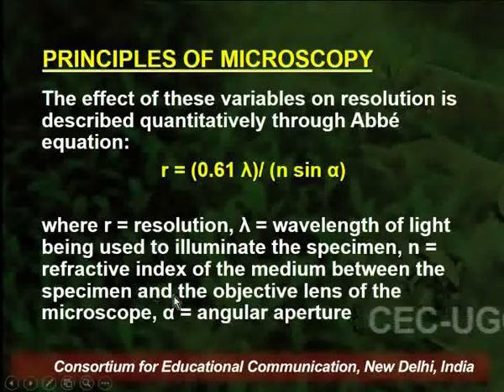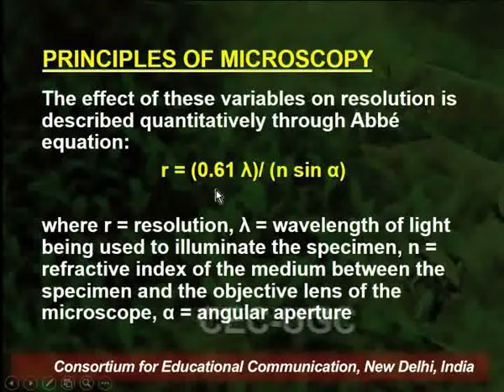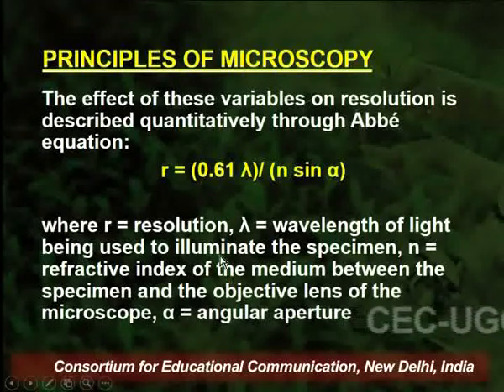Since the refractive index of the medium and angular aperture remain the same, sometimes it is also represented as NA.